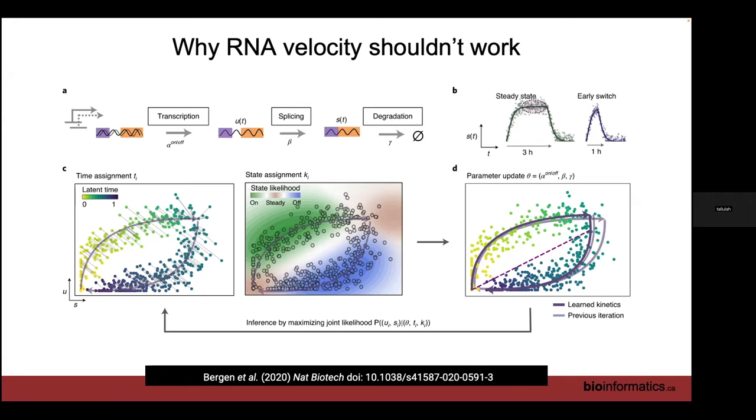So there's lots of reasons why RNA velocity shouldn't work. However, using it, it seems to work most of the time. So use at your own risk.